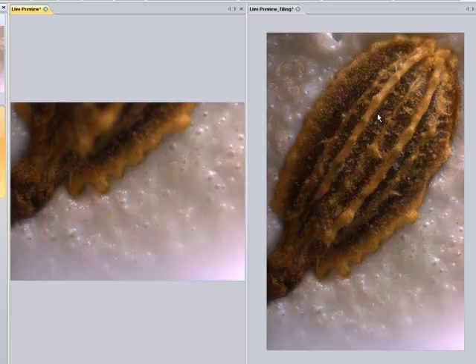And that is Image Pro Insight, with live tiling, live EDF, and the combination of the two, all built in to the main product. Thank you. Bye-bye.